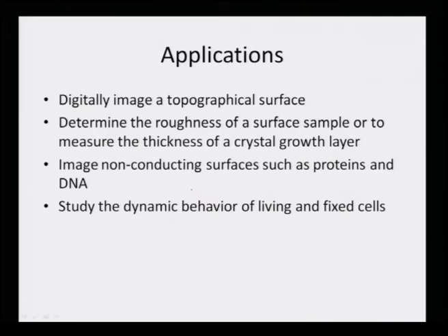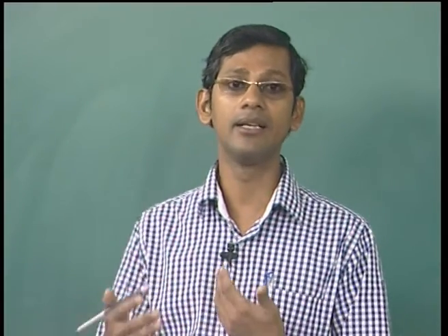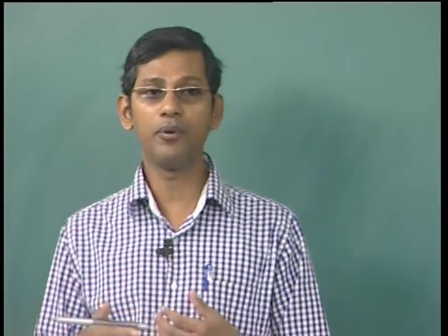Now, this can also be used for non-conductive surfaces like proteins and DNA, as I showed you. This can also be used to study the dynamical behavior of living and fixed cells. Remember, this is not exhaustive. Applications keep on coming as the technique is used more and more. So, if you want to really know about the real applications, one needs to look at the literature available in the different journals.